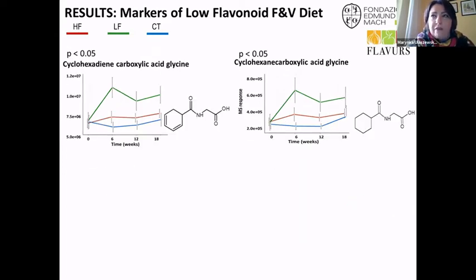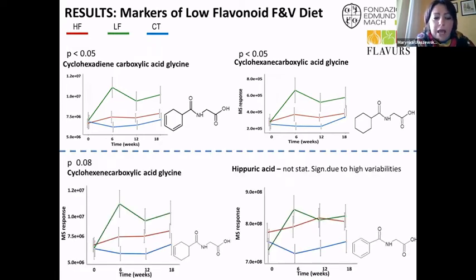But I said, okay, if I have two compounds that belong to that pathway, maybe I have something more. I was analyzing the data, looking at the trajectories, the excretion of these metabolites within the time frame. And if you look at the green trajectories in all four graphs, they're very similar, showing that indeed they were produced probably within the same metabolic pathway.